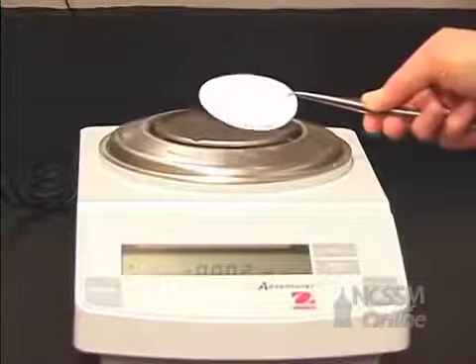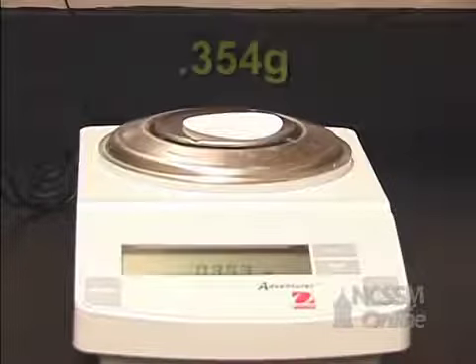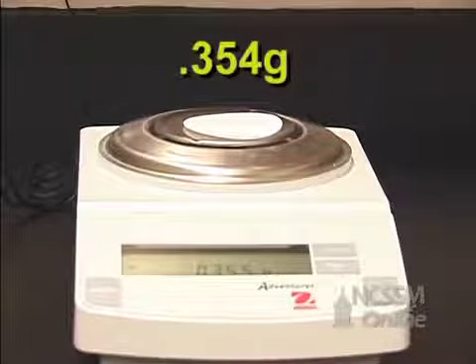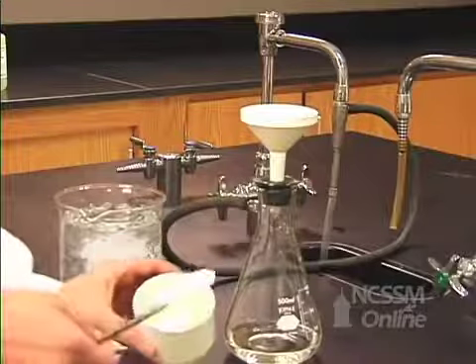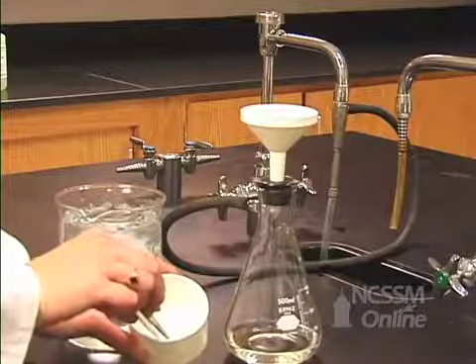We're going to weigh a filter paper. All right, the filter paper weighs 0.354 grams. So make sure you record that number. I'll place my weighed filter paper in the funnel and set up my filtering apparatus again.